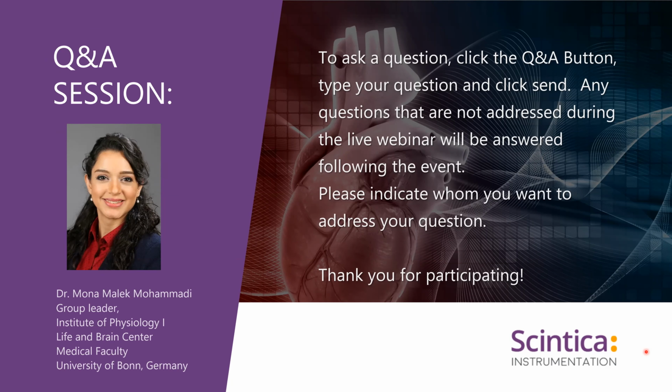Yeah, so familiarize yourself with the anatomy first, and then maybe use dead adult mice to learn where the aorta is located and how you can really constrict it. If you have the permission, it's even a good idea to perform the surgery on adult mice and then start using neonatal mice.